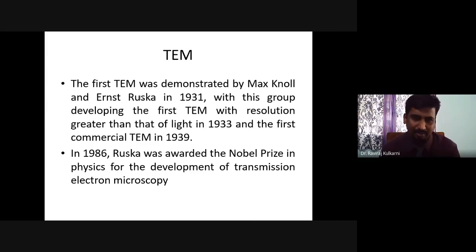Our light microscope is around 250 nanometers. Earlier there was no instrument to separate or resolve anything finer. The maximum resolving power was 250 nanometers. Anything less than that we cannot see, we cannot resolve.